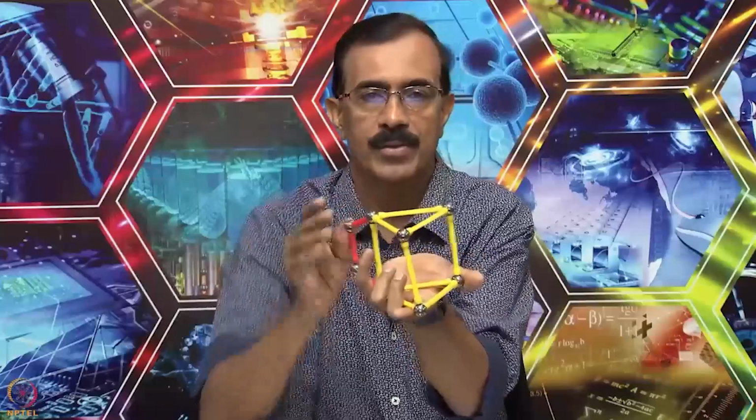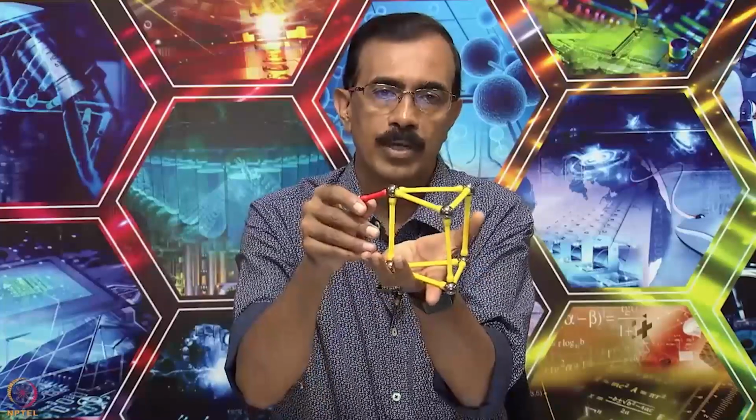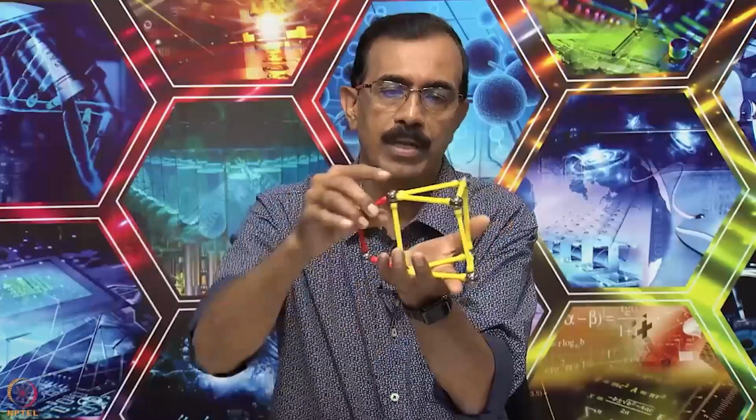That means when we look into the 13C NMR spectrum of this compound, it shows only one signal for all four carbon atoms. That clearly indicates that this compound has trigonal prismatic geometry with all methyl groups in one plane, something like this. So we can conclude without any problem. Whatever statement is made in the question can be fulfilled by this kind of geometry. And of course these two phosphorus atoms are identical, so the phosphorus NMR shows only one signal.